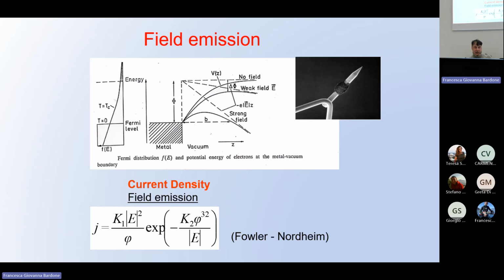So every type of solid does not produce electrons. Why? They are made of atoms, and every atom is made of electrons. Why do electrons not escape from any type of solid? Because to escape from the solid, they should pass a barrier, and for every type of material, they cannot pass the barrier.